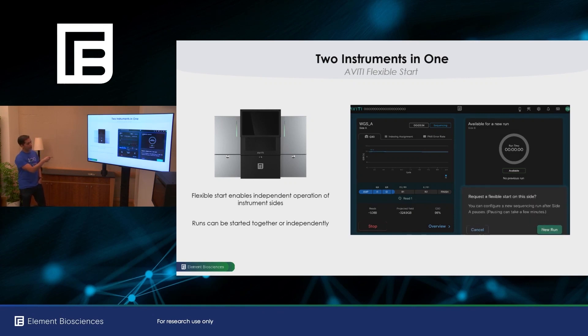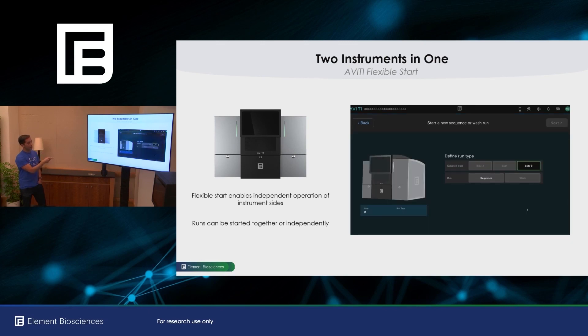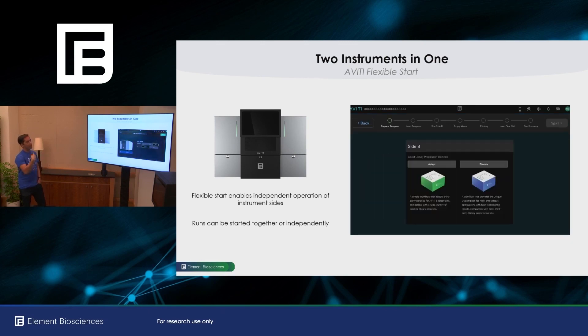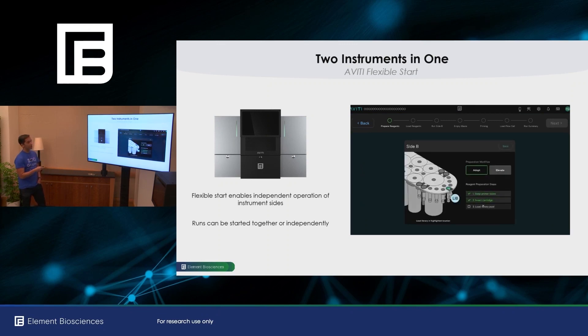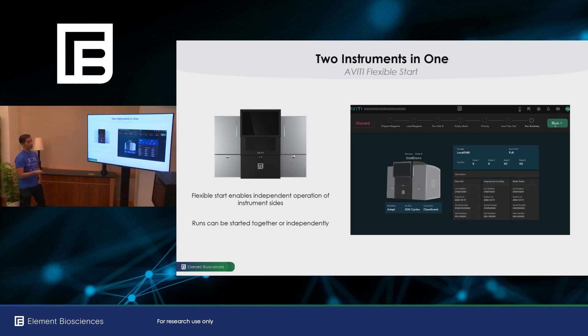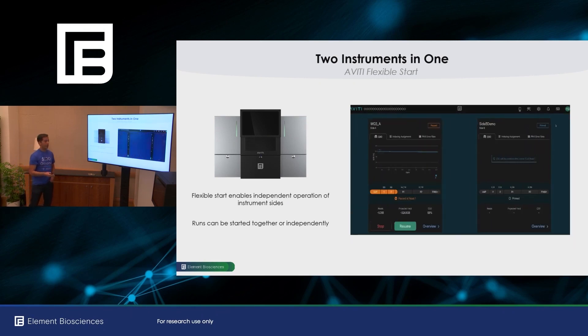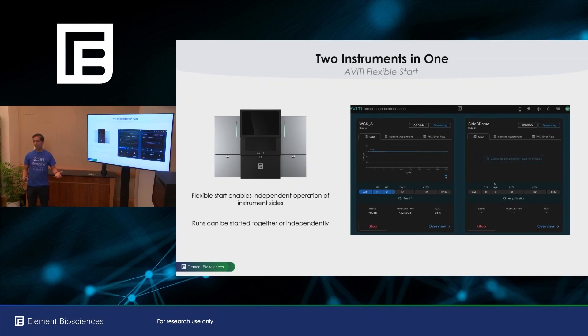So here, side A is running. We've requested a new run on side B. You wait for side A to get to a safe state to pause. And then it brings you into the workflow. We've already walked through the workflow, so we'll just skip through this. You'll get to the run summary screen. And then when you start your run, side A is automatically resumed and side B starts running. Again, very simple.